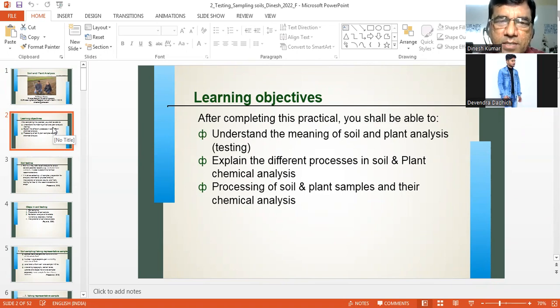So fundamentally, this lecture is not exactly a lecture, it is a kind of practical. In practical, I made a promise to you that I will teach you soil sampling and plant sampling, particularly processing of plant and soil sampling. Processing here means taking a sample and making it ready for chemical analysis. Whether it is a soil sample or plant sample, it is required to be processed. It is required to be made a representative sample in the best possible way.